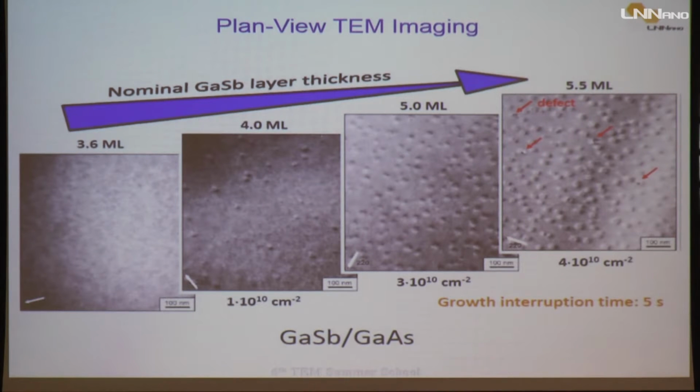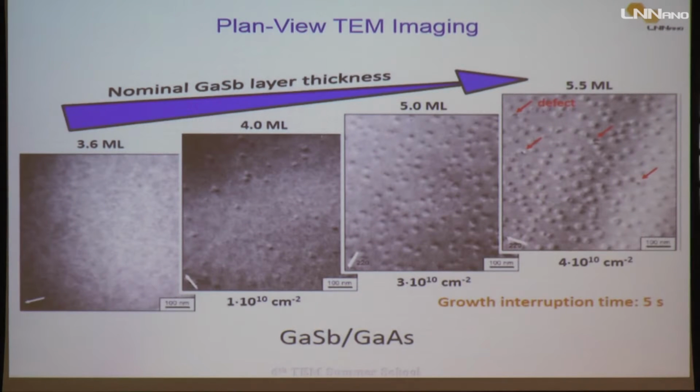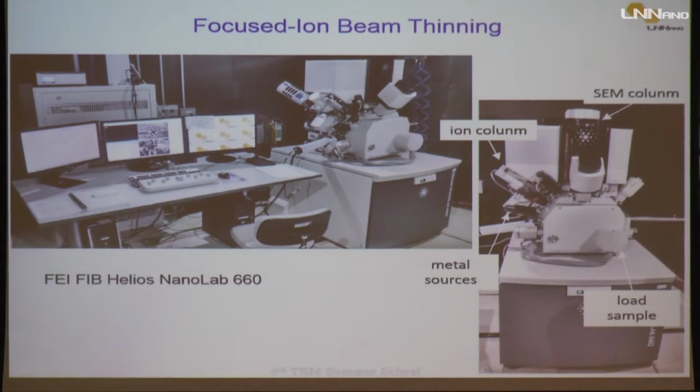Here is the preparation in plan view, okay? Here you have, as you increase the number of quantum dots on your material, you see more of these objects that are actually your quantum dots. And then you may have here, as we saw, information about the size, the distribution, spatial correlation, and so on. Here you can see the height of the quantum dots, the width, and so on. Okay? This is what we get then with plan view preparation of bulk materials and cross-section view of the material.